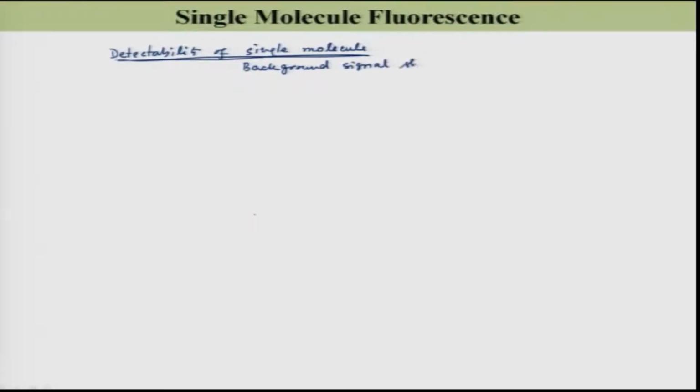So, the background signal should be extremely small. Let us say you have this sample cell and you want to take a single molecule inside this sample cell, and the sample cell is filled with some solvent.